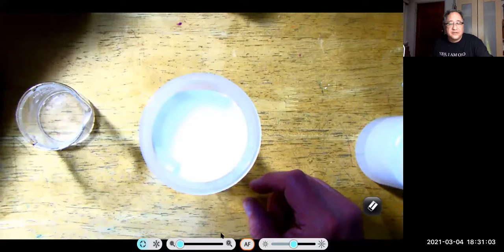Actually, I'm going to stop share. So here you can see what this looks like from the side. And do you see that little drip of water coming out? That drip has lithium ions in it, or sodium or potassium, depending on what it started with. And it has chloride ions in it, and it has excess calcium ions in it. It should have no carbonate ions in it.